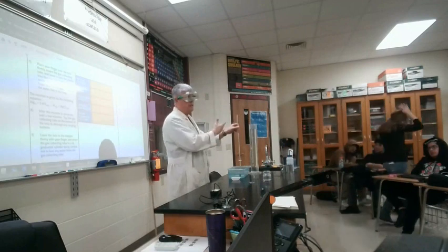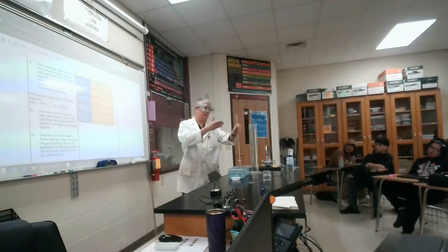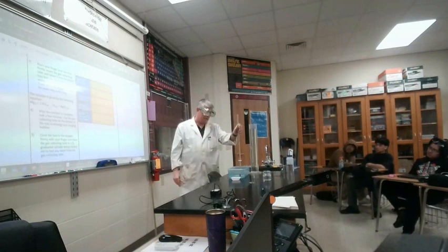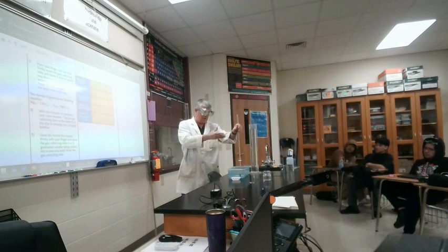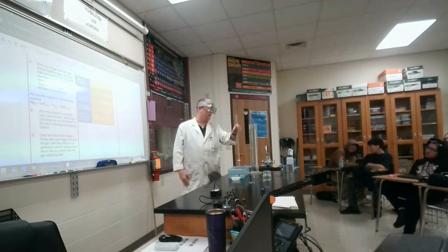Now, you need to make observations while this is going on. You can't see it from there, but I can see a lot happening in there, including the magnesium starting to react with the hydrochloric acid. Now, this is going to take a few seconds, maybe a few minutes.